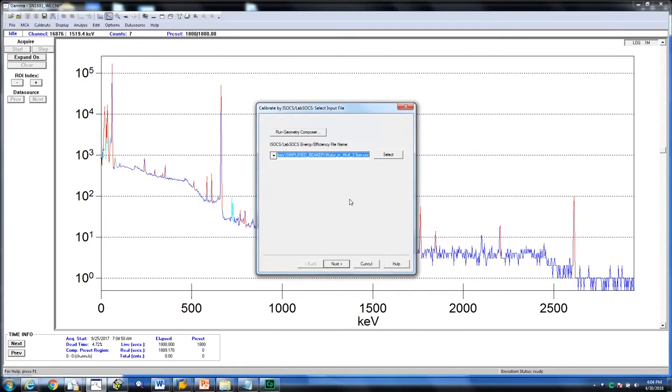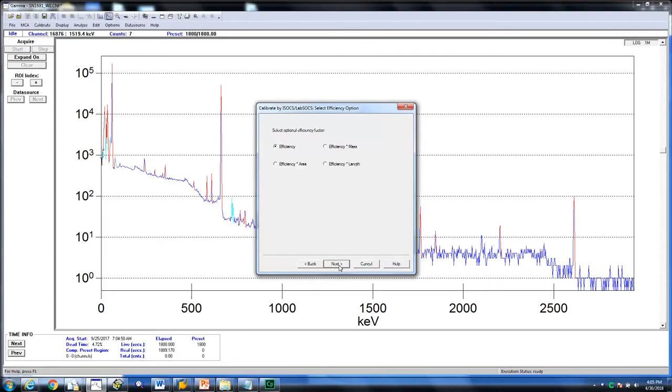Click next. You will now see different efficiency options. Standard efficiency, mass metric efficiency, or having a multiplier by the area or length. We are going to choose standard efficiency. Click next.